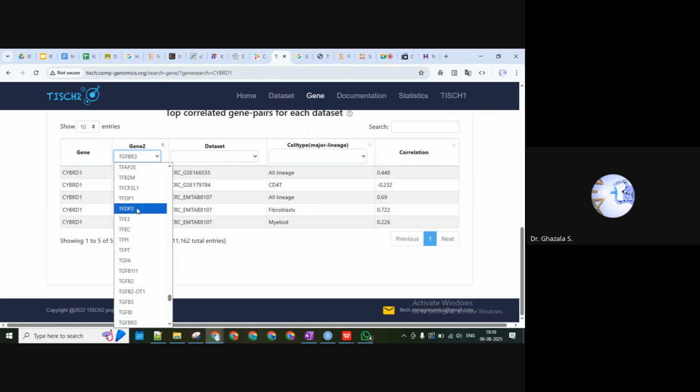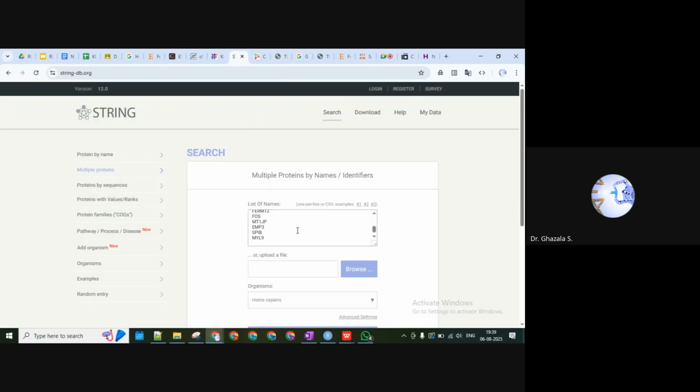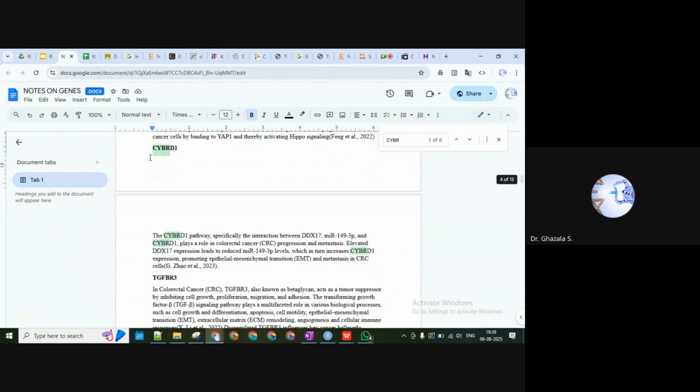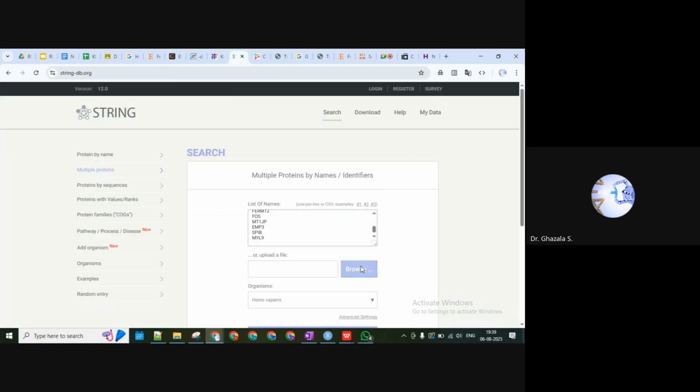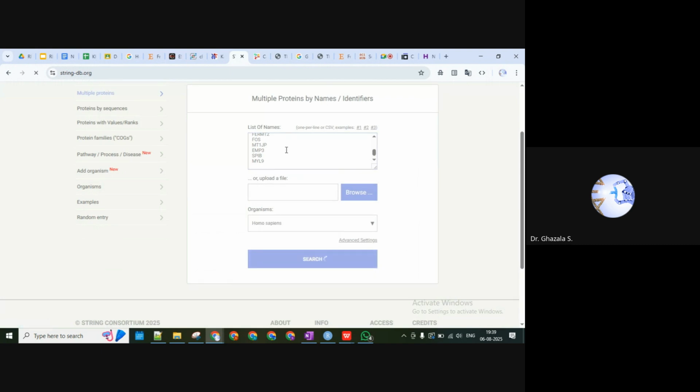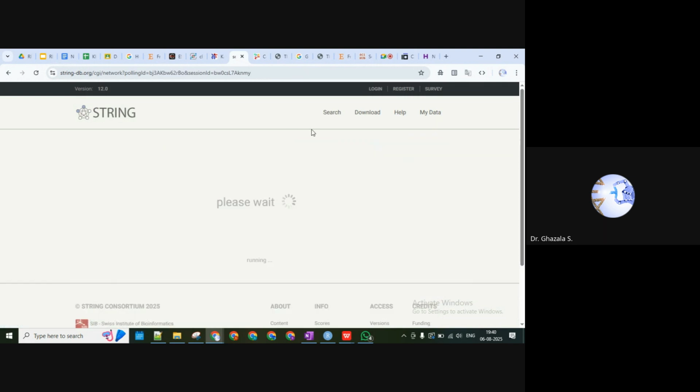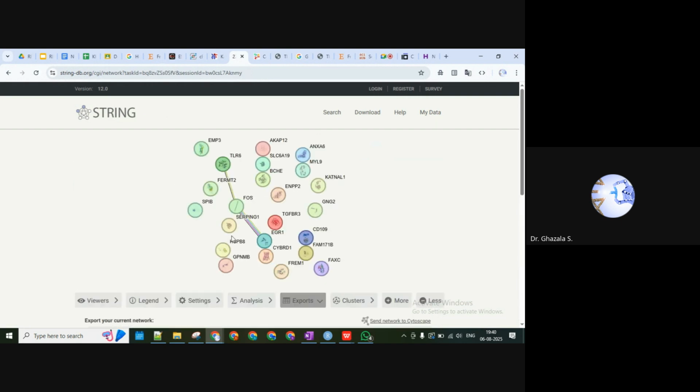So for that, we will focus on the network that we are going to make. If the two genes are correlated, for example, the already known gene, that's why I'm asking you to filter the list of genes which are already known and for which no evidence is present. Then accordingly, we can map the two lists between the genes and study their relation. So let me focus on BCHE and CYBRD1. That's how we will try to make the network. When we have an objective in mind about what we want to focus on, we can do many modifications in the network.